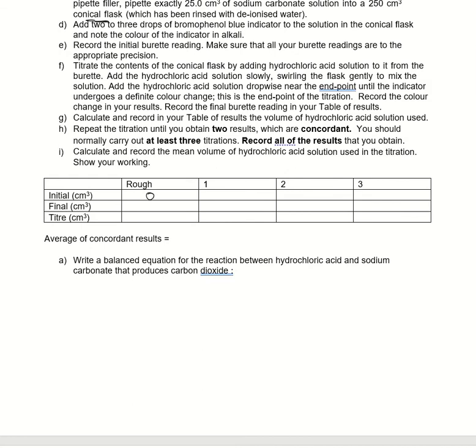Right, so just to make up some results, we'll say 23.10. As usual, with a rough, you've probably overshot it, so we'll say a little bit less, and then we'll say I filled it up, didn't get exactly to the start.